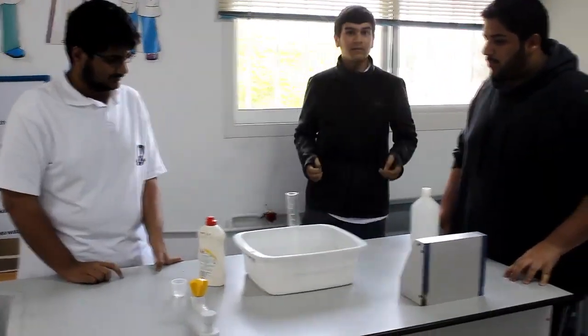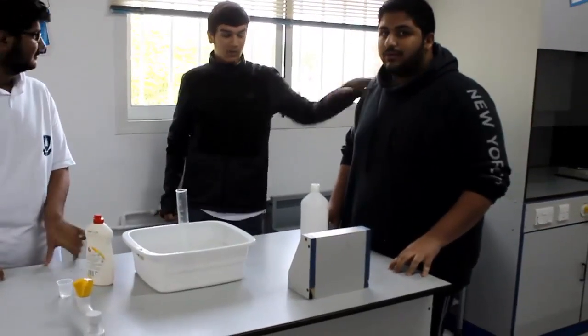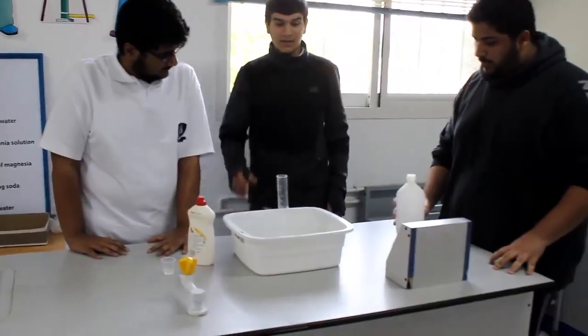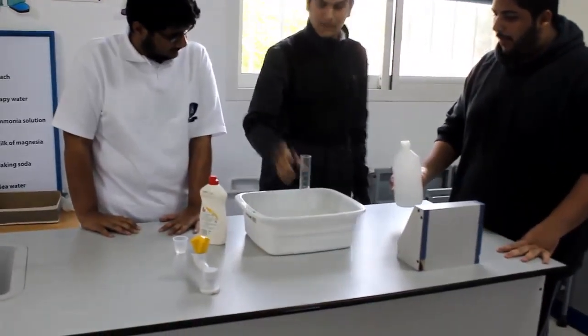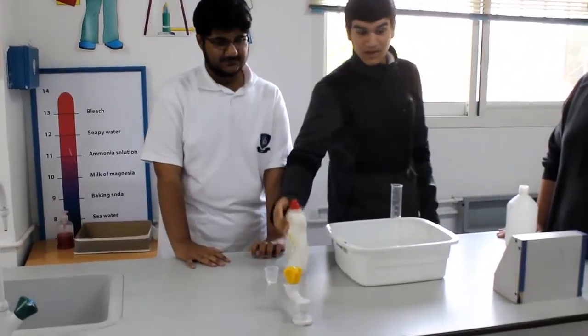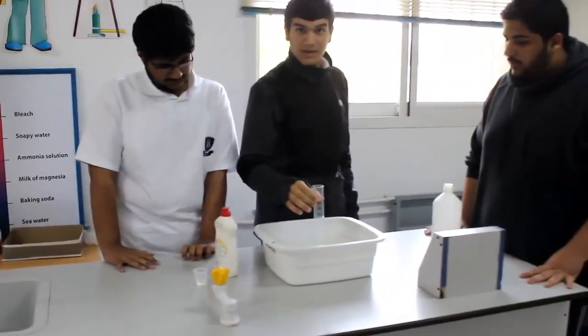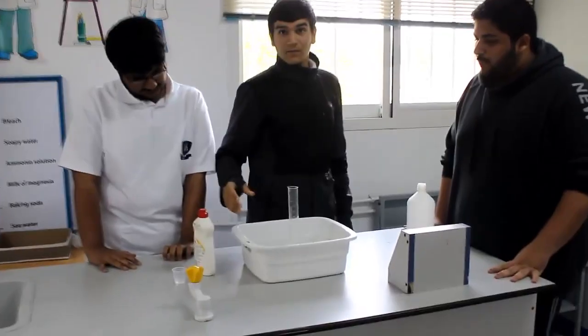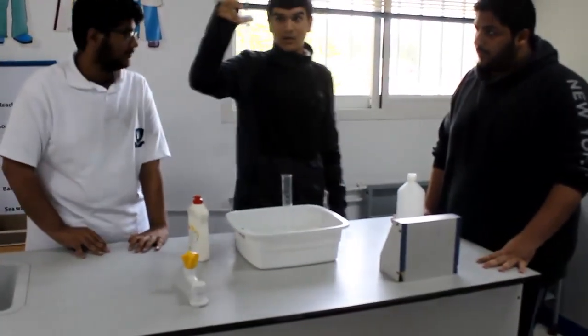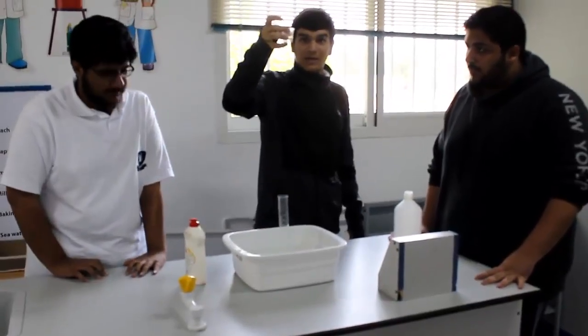In this experiment, my friend Abdelaziz Al-Qasmi will pour 50 milliliters of hydrogen peroxide inside the graduated cylinder, and my friend Abdullah Ghulam will pour dish soap inside the graduated cylinder. After that, he will also add potassium iodide. Potassium iodide is the catalyst of this reaction. It is not listed inside the reaction when you are writing it.